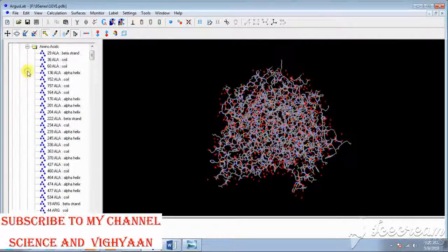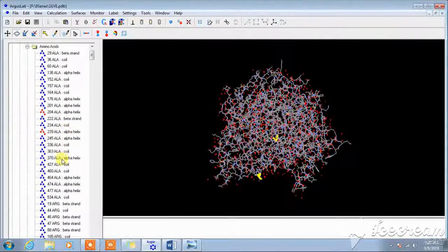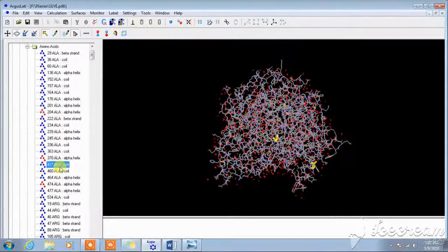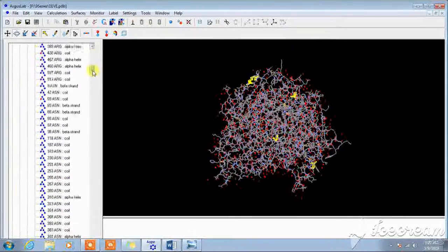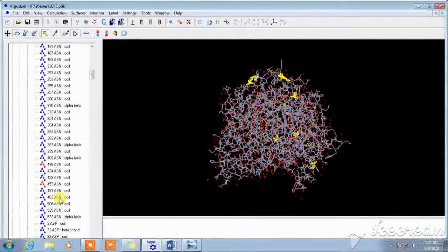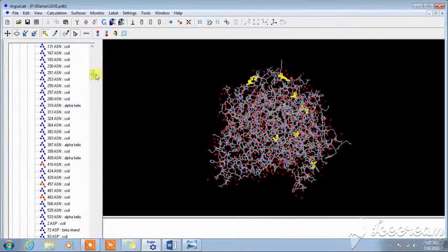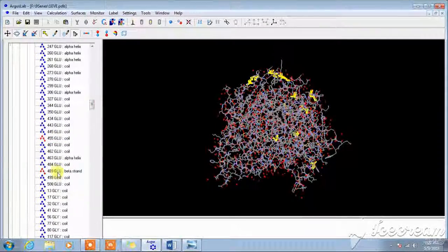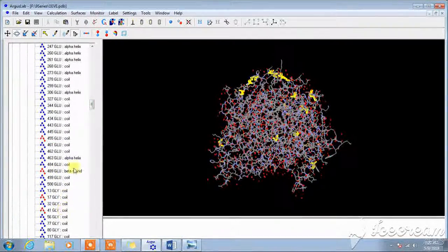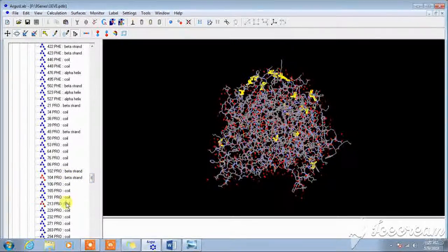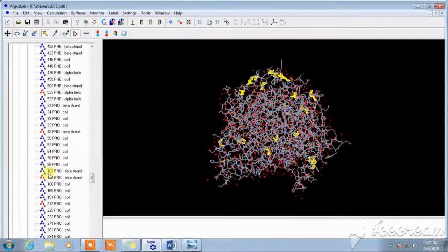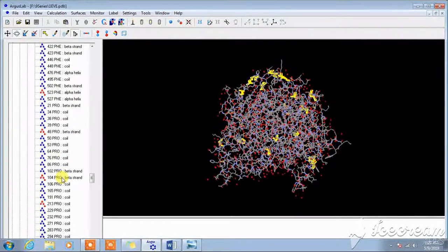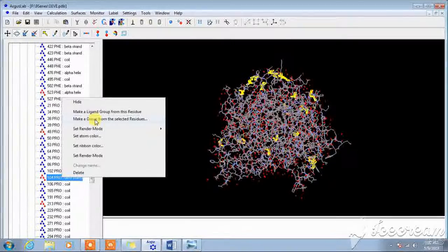Right now I'll choose random amino acids because these amino acids is used for demo purposes only. For example, these are the active amino acids present in the binding site. Now make a group from this ligand and this one is a binding site.